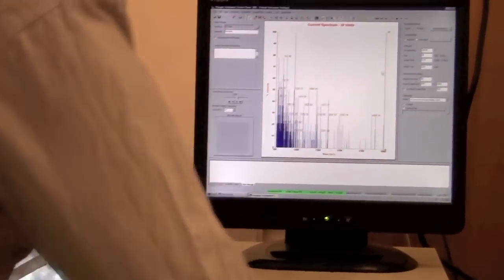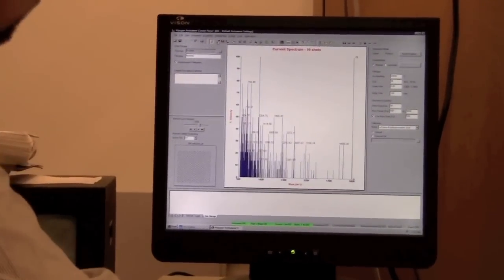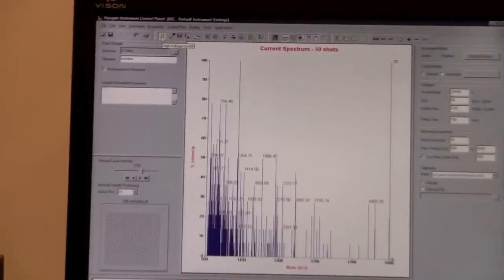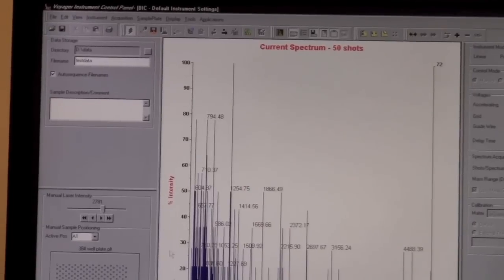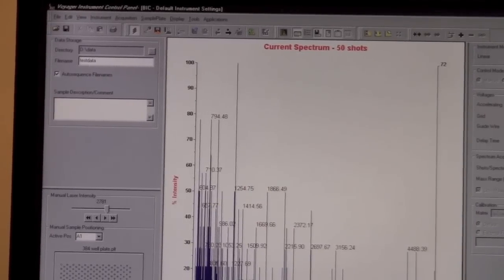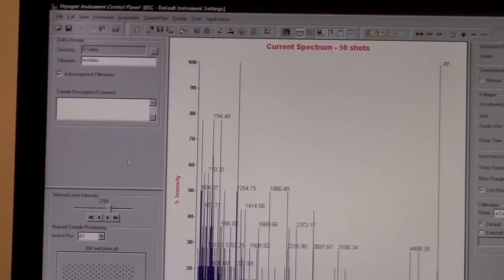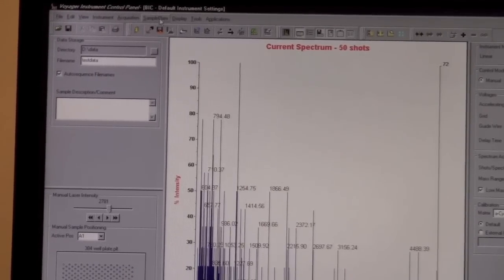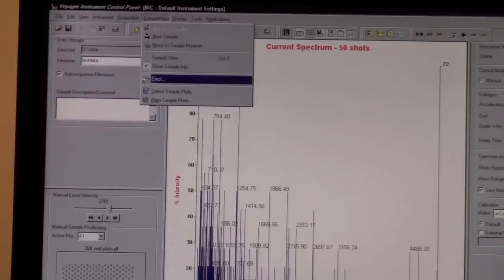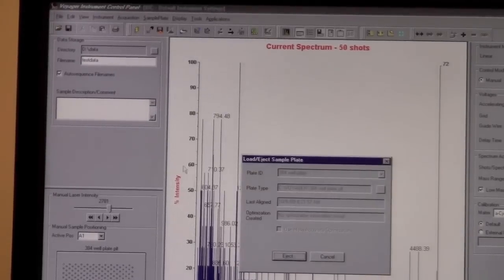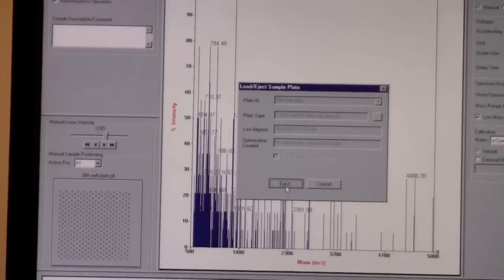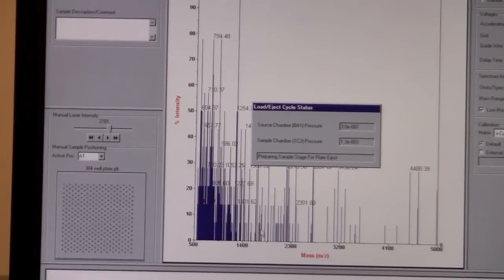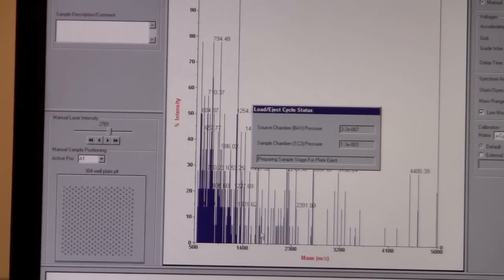And next, we want to eject the sample plate, so we'll go back to the lightning bolt here and we'll turn off the high voltage. And it should ramp down the high voltage. And then we'll go back to sample plate and we will go to eject and select eject. Again, this process takes a few minutes, so we'll wait for it to happen and we'll continue on.